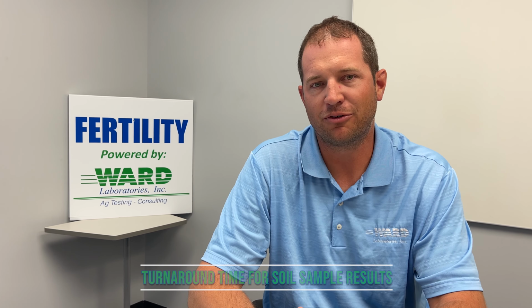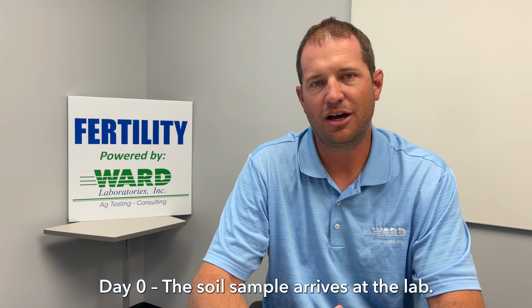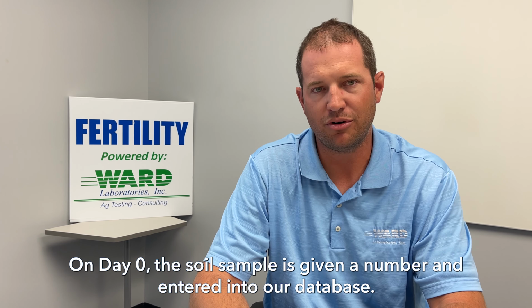Today we're going to go over turnaround time for soil samples. So when a soil sample arrives at the lab, we deem that as day zero, its arrival. Say that's a Monday, the soil sample's arrived. It is given a number and entered into our database as a soil sample. Day one begins the next day.